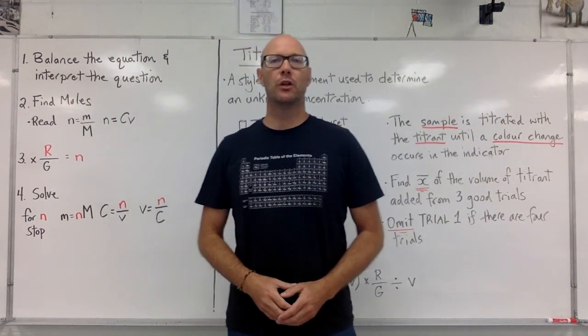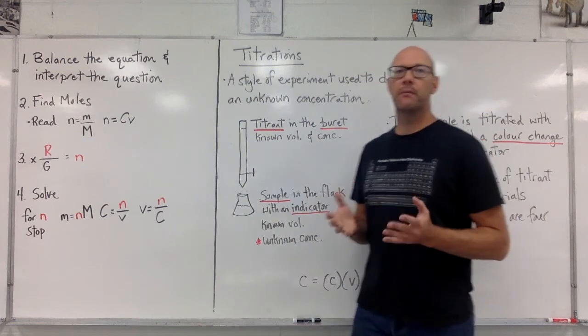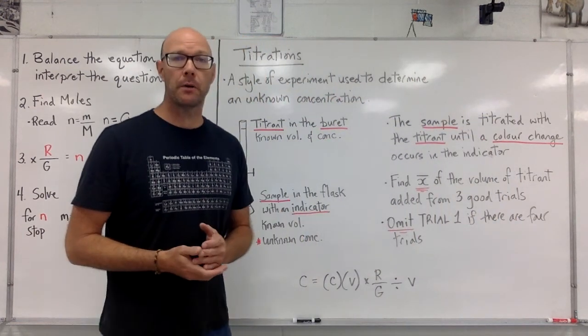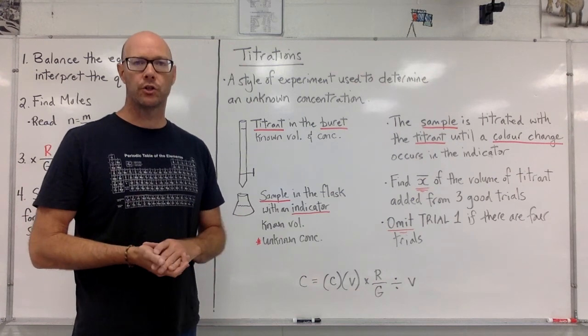Everyone. This is our look at titrations. Titrations, it's a type of experiment. It's a style of experiment that we perform to determine an unknown concentration.